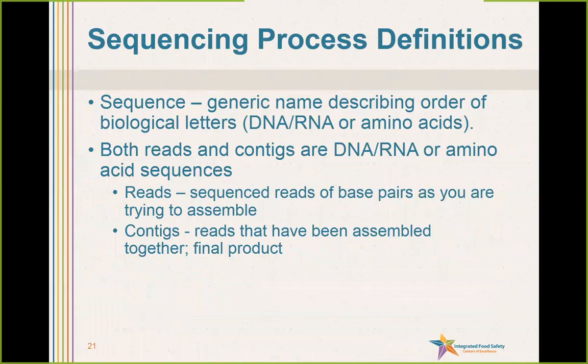So I've talked a bit about the machines needed to do whole genome sequencing and how there might be elements within a raw specimen that need to be taken into consideration for analysis purposes. But in order to understand how an isolate gets to be analyzed, we need to talk about the machinery and the DNA differences of the raw product. But I've not talked about how you put all these pieces together.